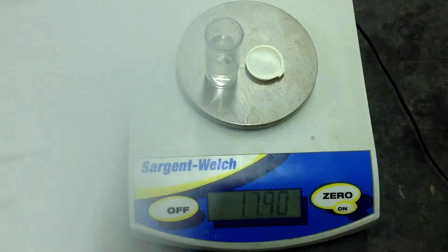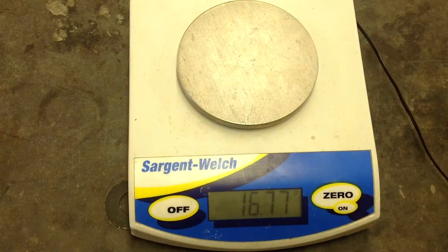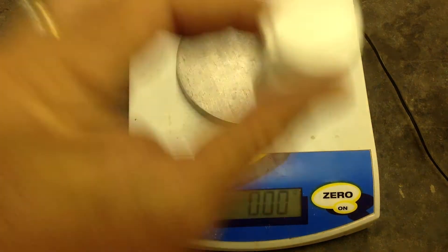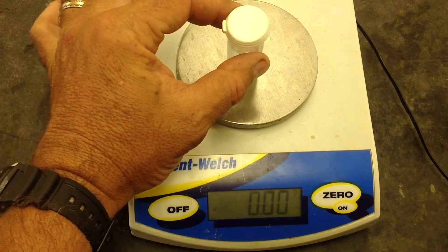That's right there. Then what we will do is take our salt and water and mix those two together, shake them up, and let the salt dissolve, then mass it again.